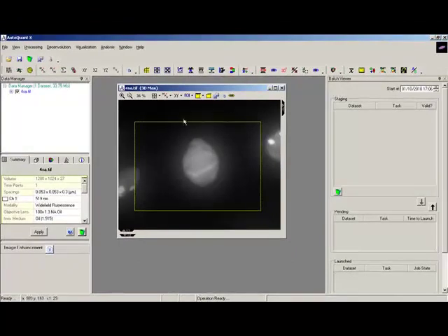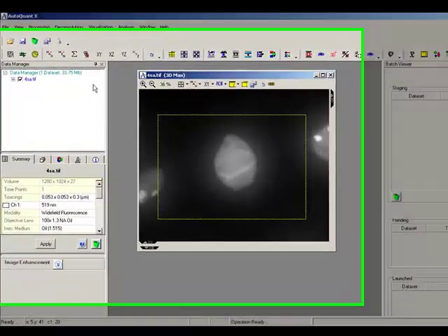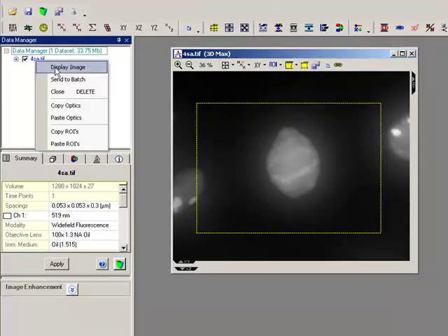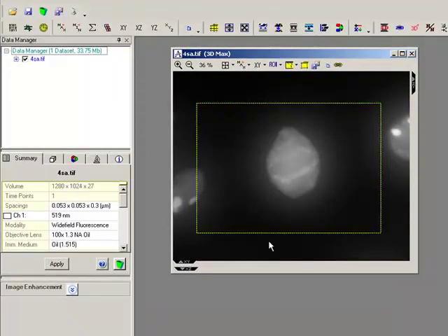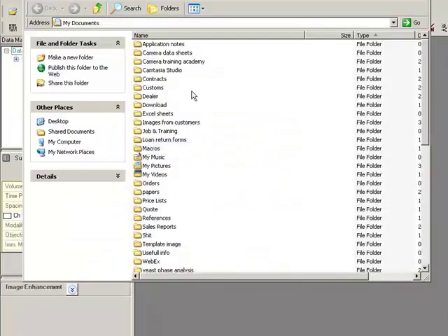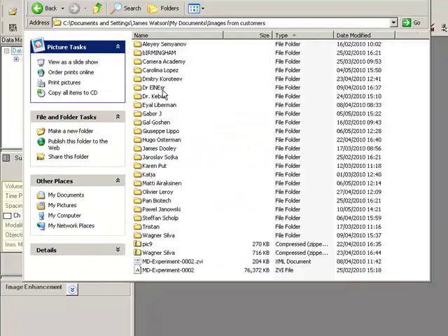There are a couple of different ways that I can add datasets into it. Firstly, if they're open in AutoQuant already I can right-click and simply send them to the batch, or I could browse Windows Explorer and add them in this way.